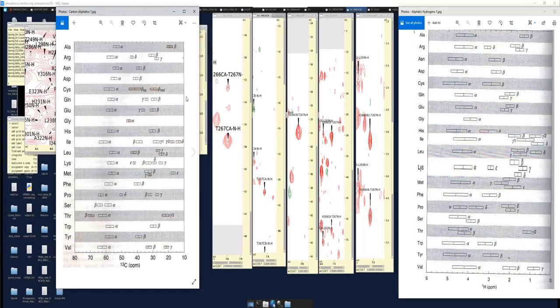So going purely off just the C alpha C beta, we see with those values, it could be glutamine or glutamic acid. It could be potentially a cysteine. It could be arginines. Could be histidines. So it's difficult just using the C alpha C beta to determine what type of amino acid that I-1 is.